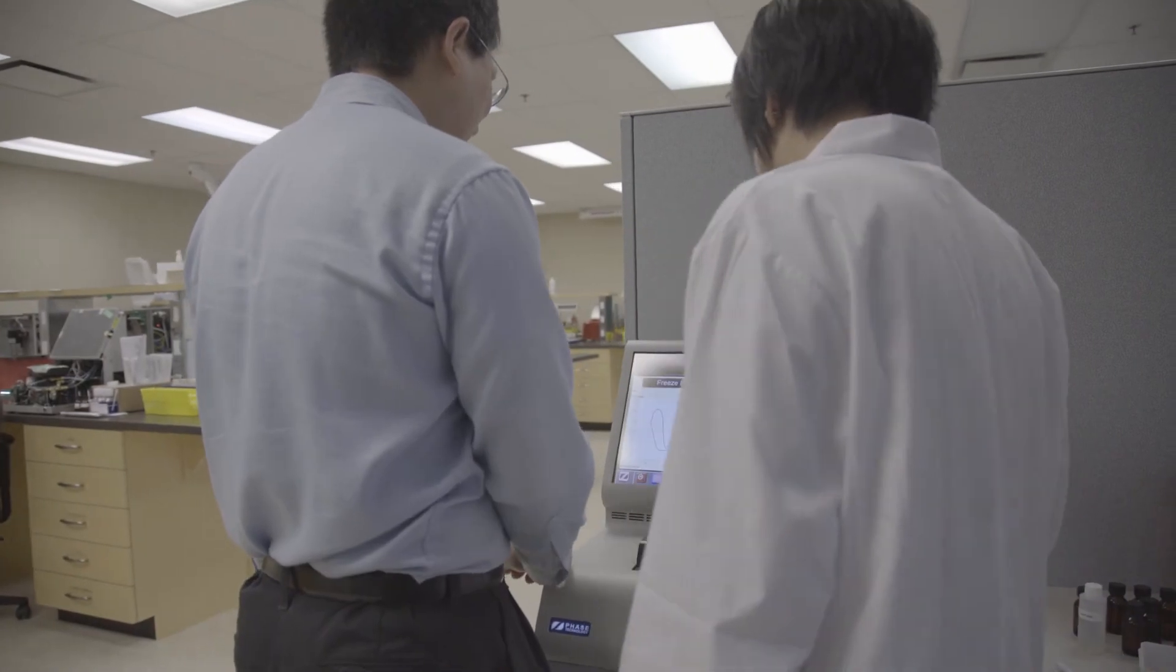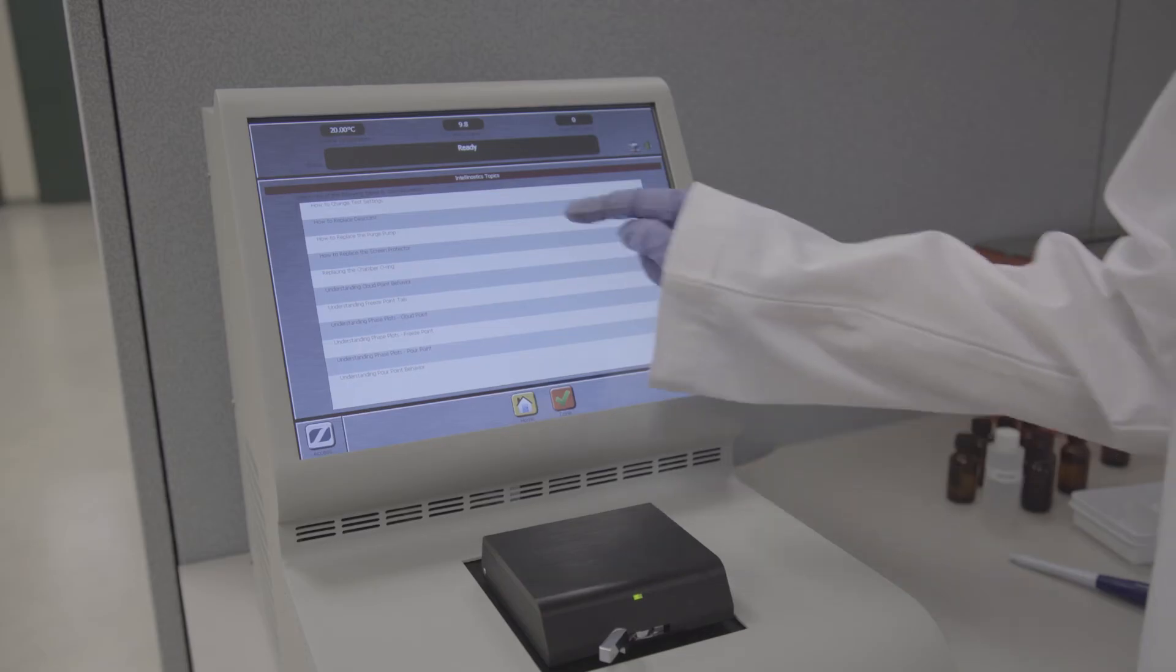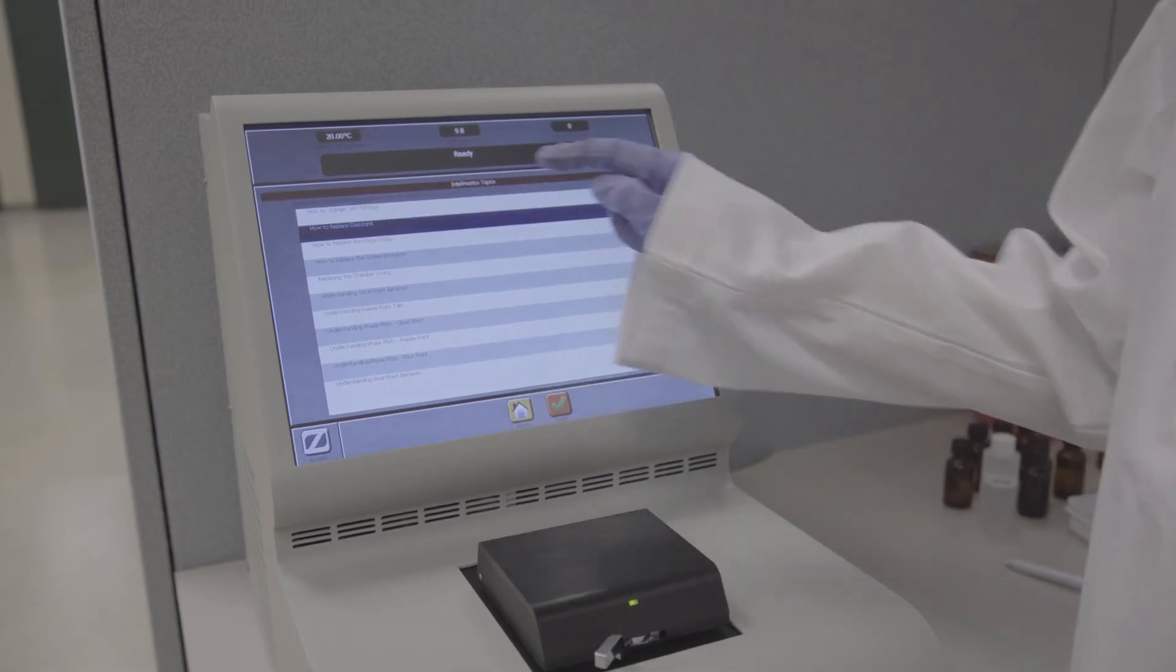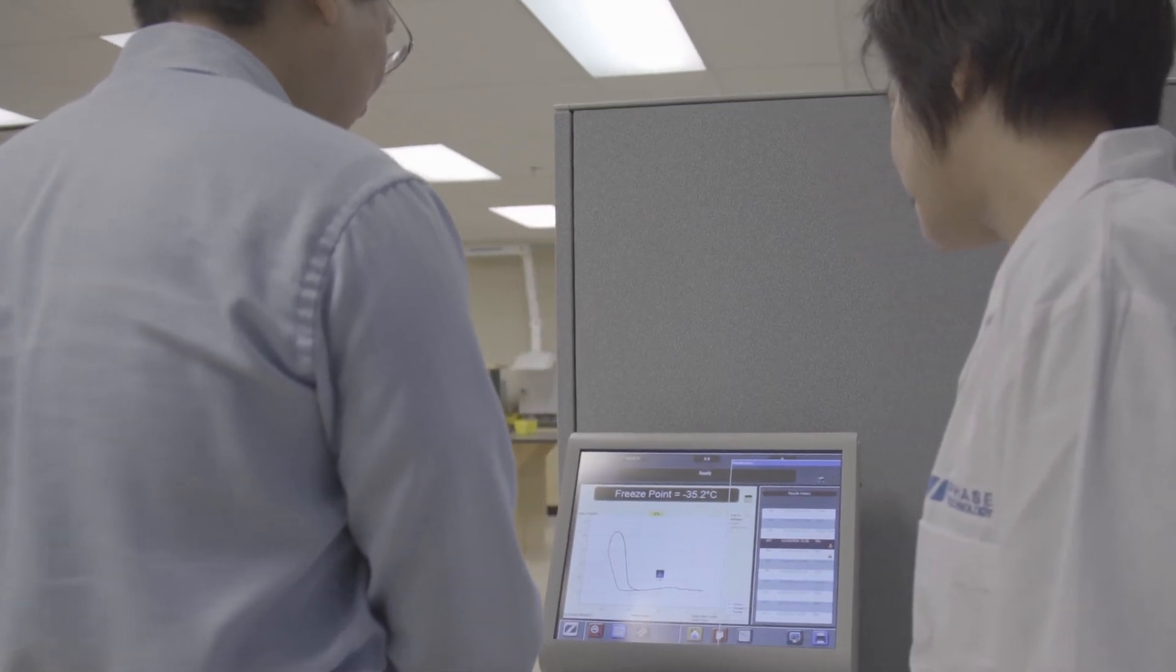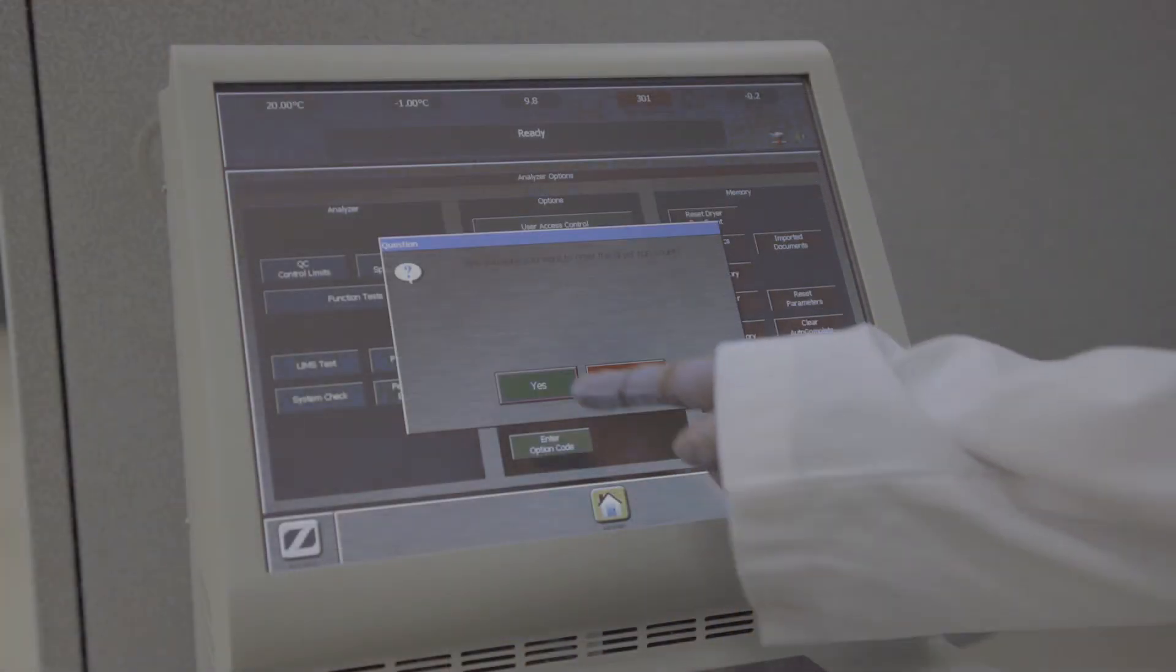The JFA 70XI's interface offers quick and responsive solutions with built-in alert messages that provide troubleshooting options, self-guided tutorials, and system checks that verify performance and determine problems with critical components.